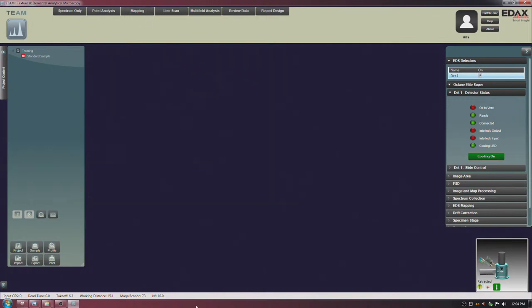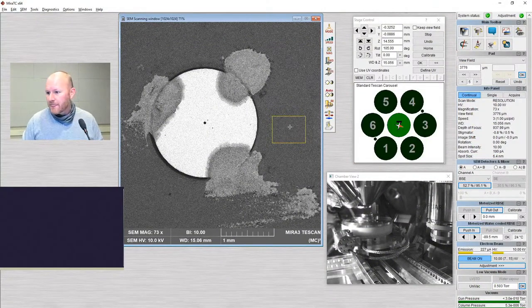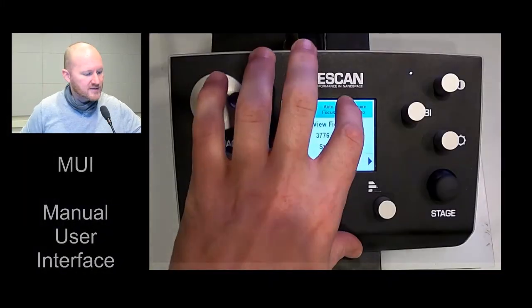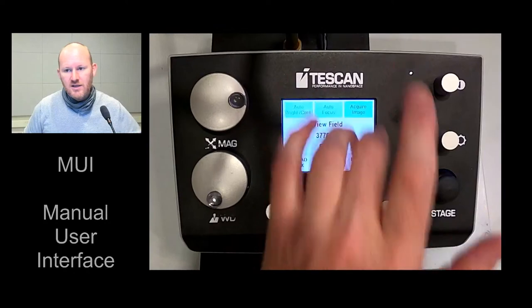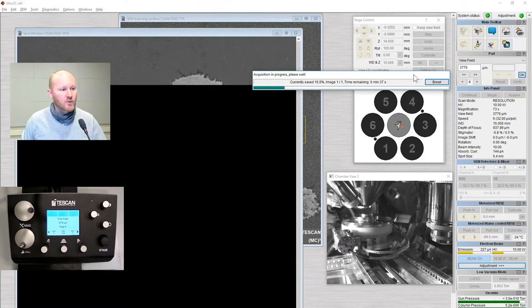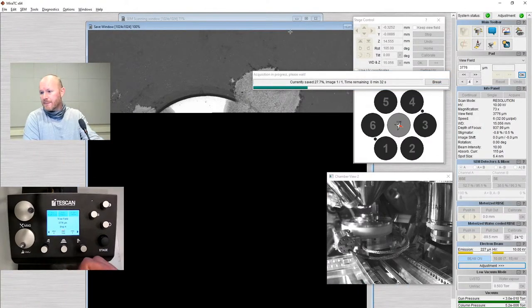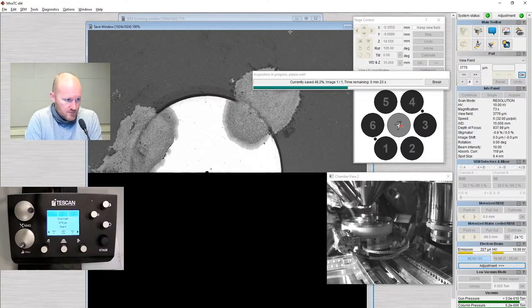There are a couple things I can do. I can utilize the reduced raster window. In the mirror software I now have the reduced raster window on the background. There is a shortcut to acquire the image — that's the acquire image button on the touch panel. Every time I want to acquire image I just hit that button. You can see the image is acquiring — the contrast is too high here, so I would turn that contrast down if acquiring again.